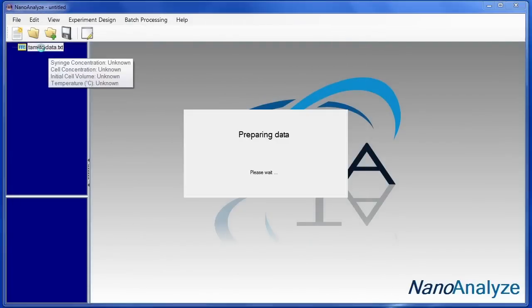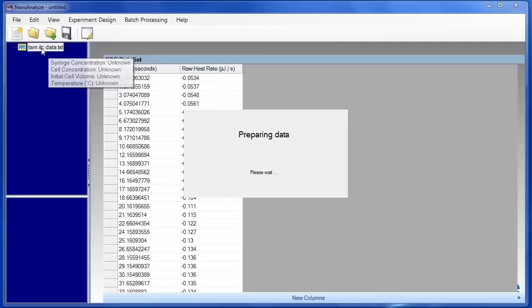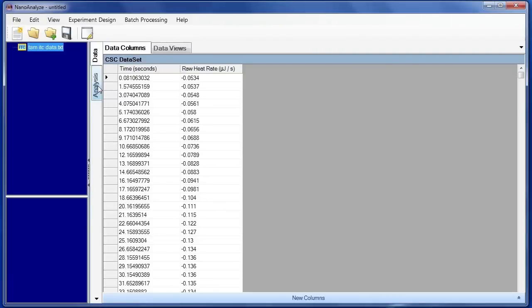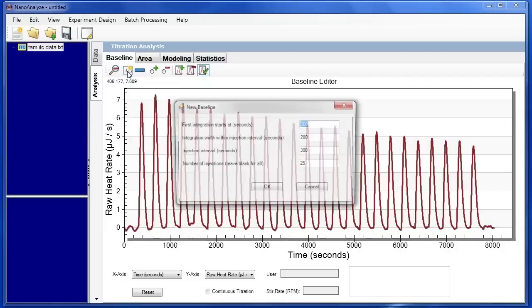Now we can click on the imported data and finish the import process. First click on Analysis. The first step within NanoAnalyze, now that the file has been opened, is to create a new baseline.